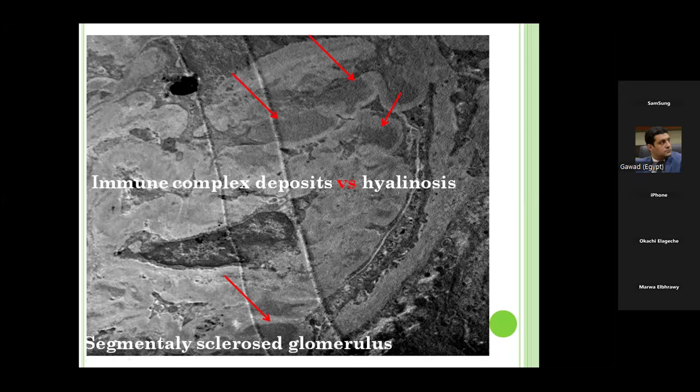If I can tell you, Dr. Mohammed, the knives that we use for ultra thin sections of the electron microscope are diamond knives. These diamond knives are very expensive. Let's not mention the price here, but they are very expensive. So when it starts to have cracks like that, it makes these knife marks. And by the way, you can publish papers with these knife marks because it's not often present in electron microscopic pictures.